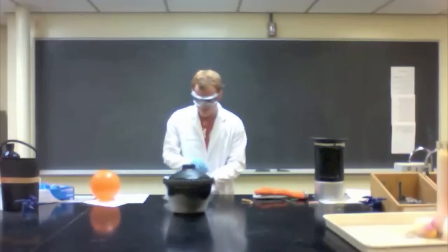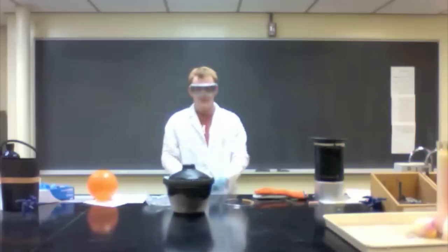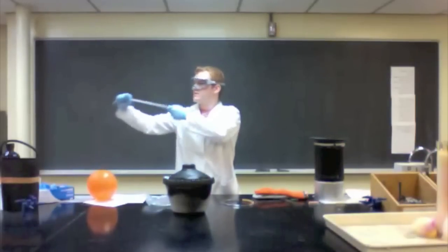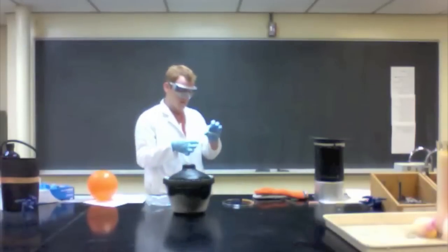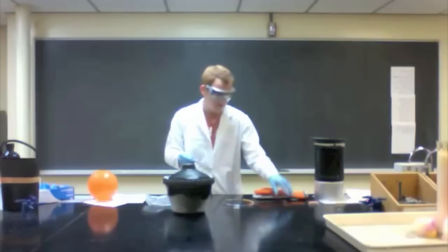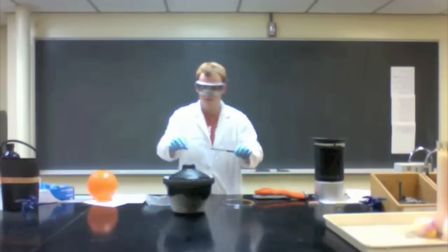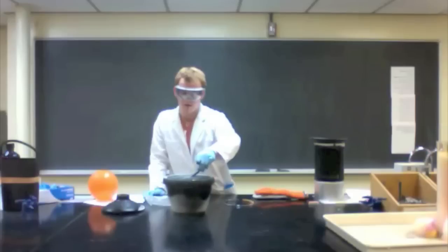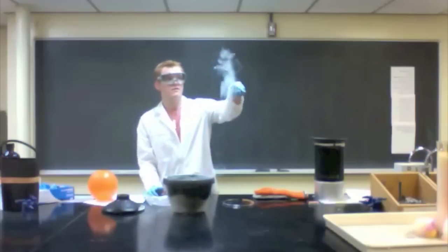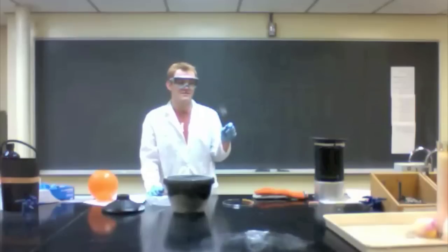For example, I can take Tygon tubing. It's a little stretchy, very bendy. Not as stretchy as rubber, but I can fold it up. Immerse it in liquid nitrogen. And before long, solid. Which is cool.